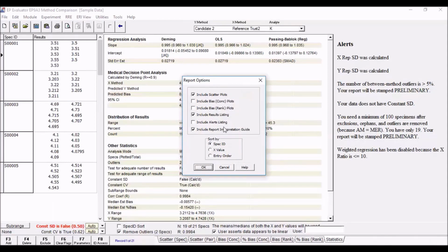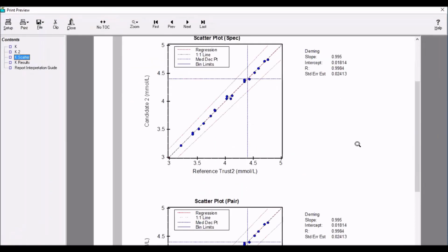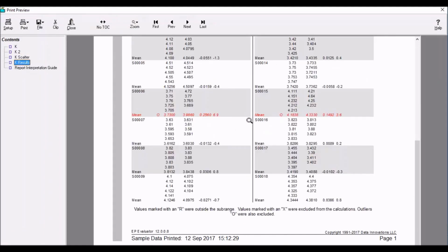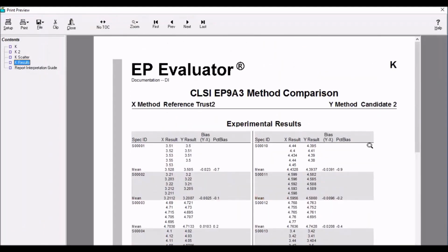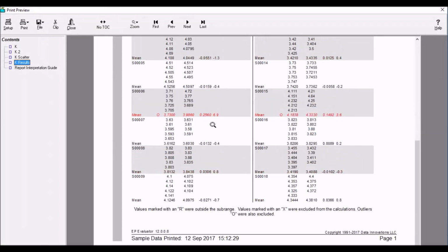So now click Print Preview to look at the final report. Choose what is to go in the reports, include experiment results data as well as plots and statistics if necessary. Here are the plots from the experiment, and the vital statistics are correctly formatted. Some choices can be made about formats in the Preferences menu.